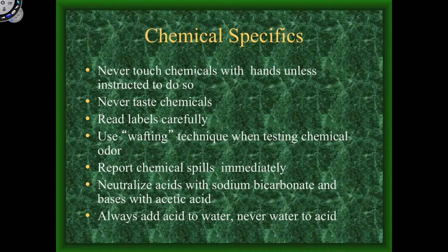The chemicals that we use are going to be in things: beakers, Erlenmeyer flasks, test tubes, crucibles, evaporating dishes, and so on and so forth. Don't ever taste chemicals.